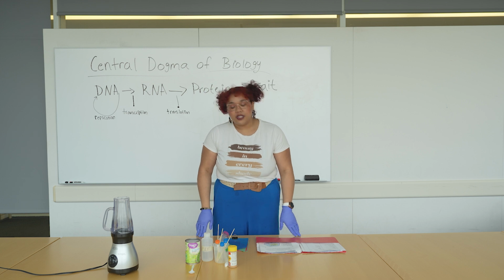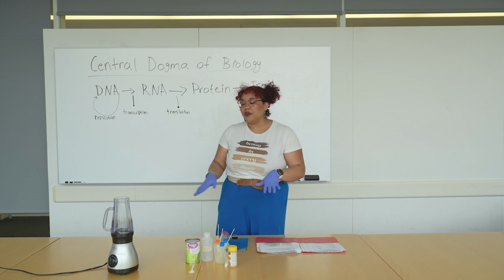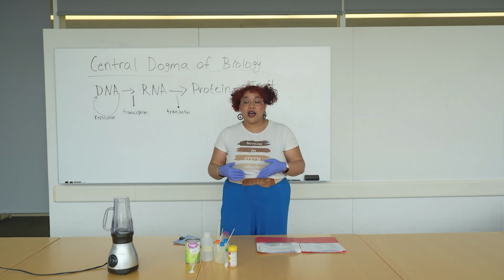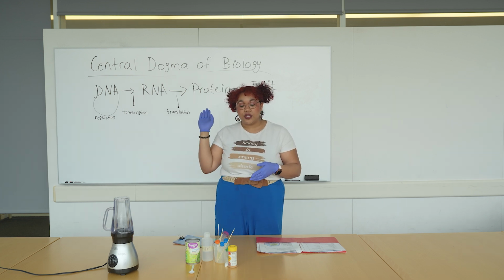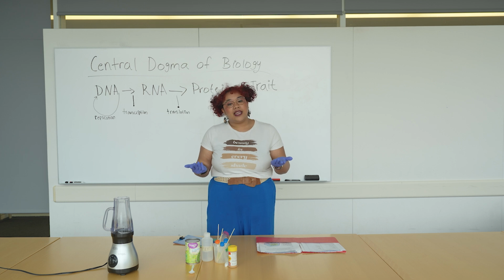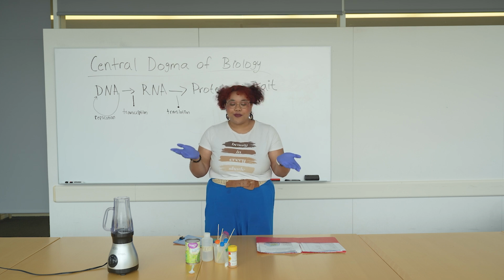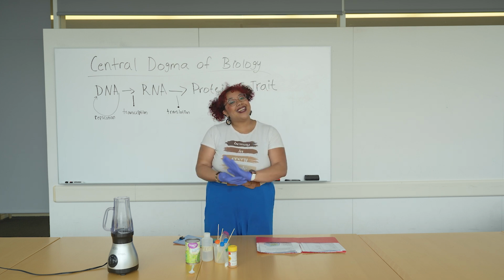And the way that we will do this for your students, we'll first go over an interactive exercise of how to extract DNA. So how does DNA actually get to turn into the protein that we see? And so in the following videos, we'll get to talk about all these different activities that you and your students can do, and learn about how awesome DNA is.